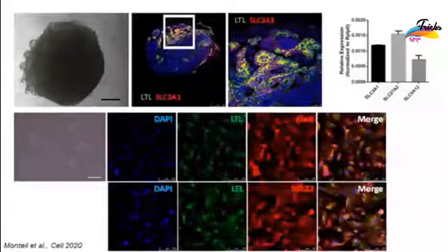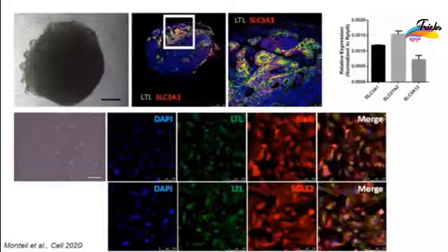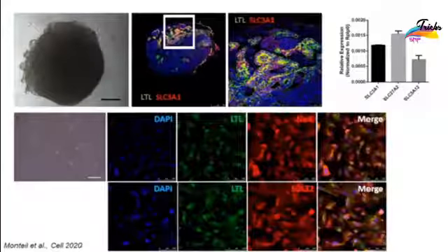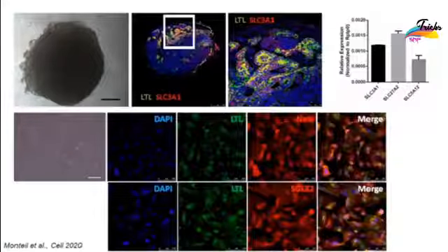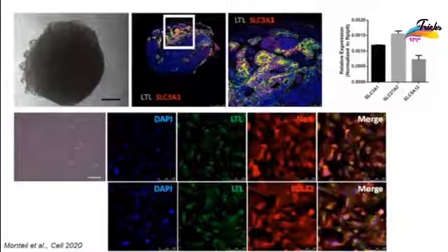Collectively, this slide represents that the organoids contain different cell types that express ACE2 in a similar fashion as observed in the native tissue, but also important function.